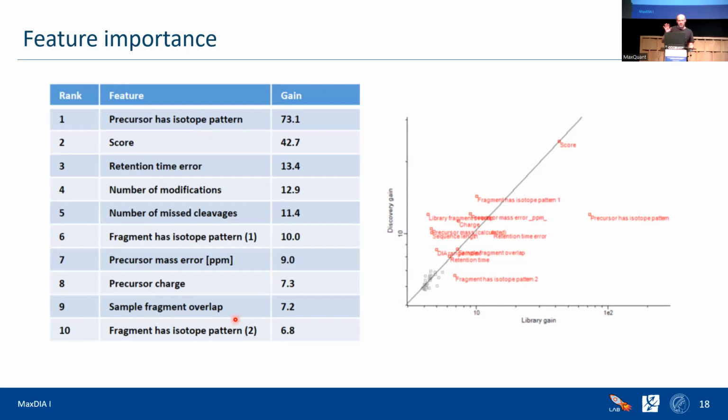And you can put all kinds of crazy modifications, SNPs, heterodimers, ubiquitin, SUMO chains, all kinds of things in the middle if you don't have the Y and B series overlapping. Fortunately, XGBoost told us that this is an important feature, which made it into the top 10 ranking of the features.